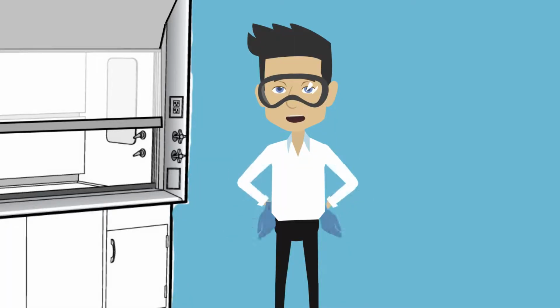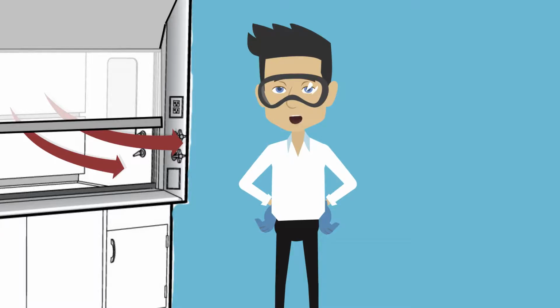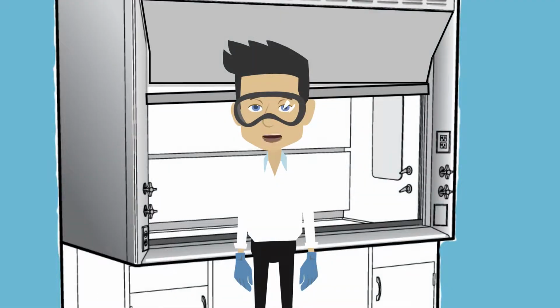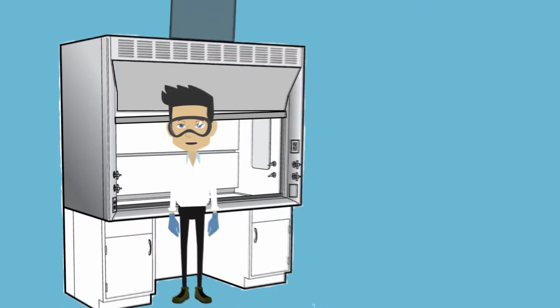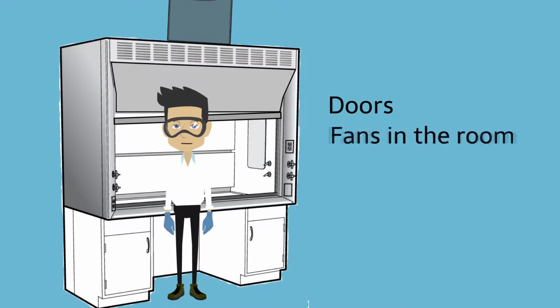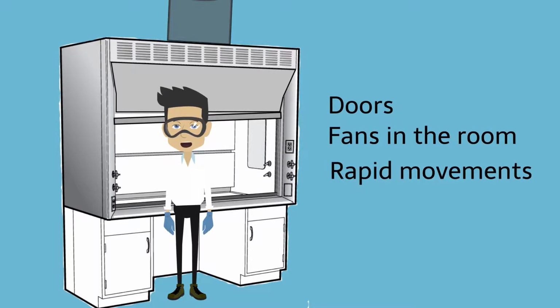You also want to avoid creating cross drafts while working in the hood. A cross-draft can pull contaminated air out of the hood and into the air you're breathing. The kind of situations that can cause cross-drafts or turbulence that you want to look for include doors opening and closing, fans in the room, rapid movements like raising and lowering the sash too quickly, and people walking by.